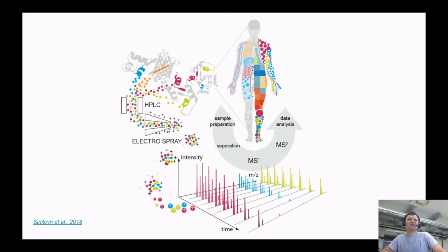Actually, I heard many suggestions, like, for example, you know the mass of this peptide, and you know which protease you used, and you can go through a window, check all peptides which can possibly be generated from this protease, and find the match. In reality, there's a case like this. Let's say we have 15 arginines and one lysine. Of course it's a very artificial case, but you can take any combinations. And the truth is that using this method, you will not be able to distinguish one combination from another combination.